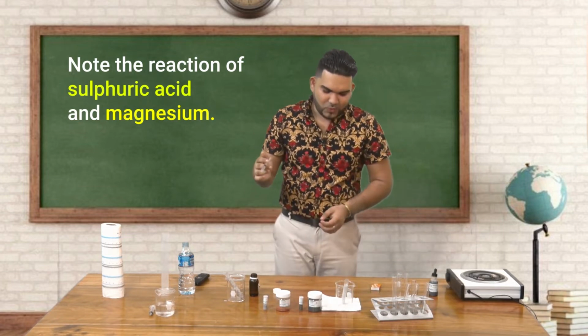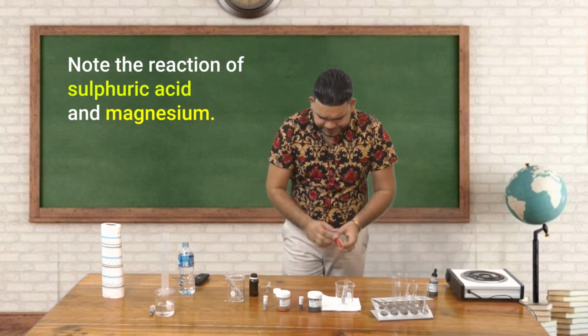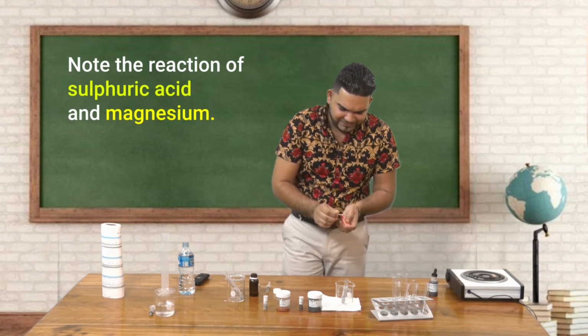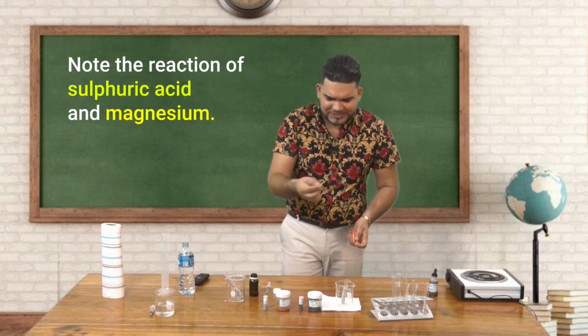Right? Look at that. Wow. That is sulfuric acid as well as magnesium. Let us light our match and see if we'll hear that popping sound like before. Alright, so I guess the gas has already escaped. We will try and see for the others.